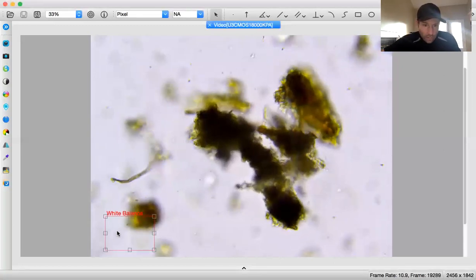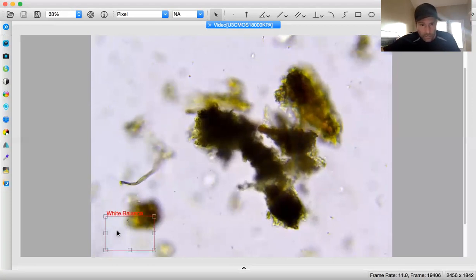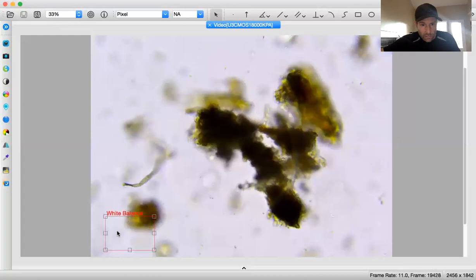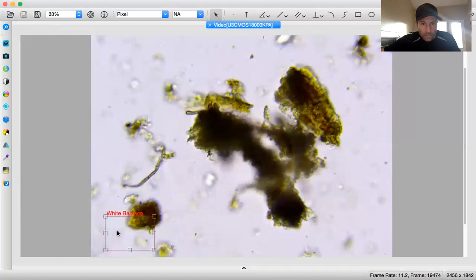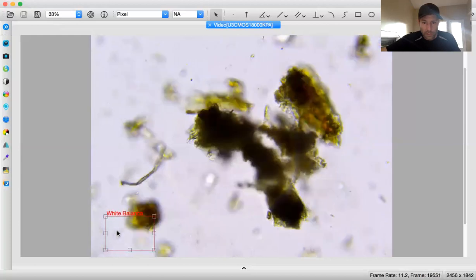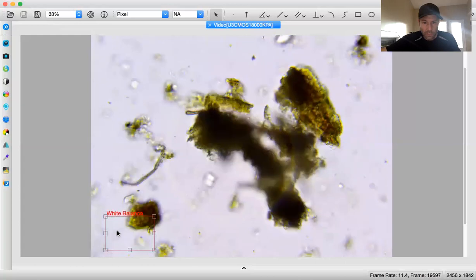Okay. Yes, I'm seeing a break that could possibly be fungi. There's some pinching going on, but that seems to be par for the course when there's a lot of stuff to grow through, and the person who made this compost put a lot of sand in it. So yeah, there's lots of aggregation with sand that they can grow through there.